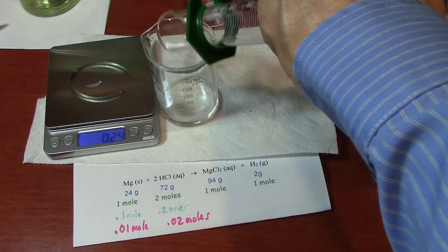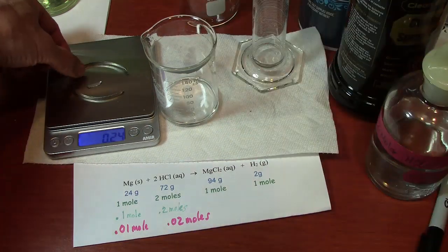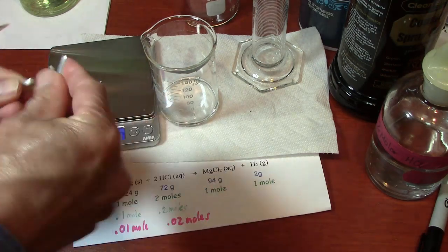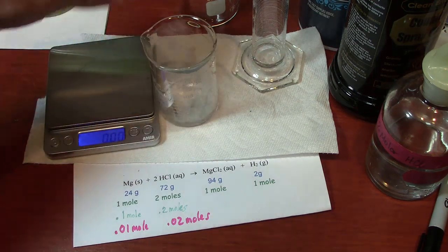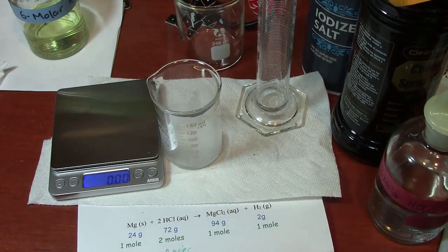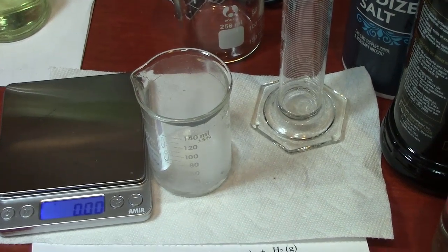0.02 moles of HCl in the beaker, and in goes the magnesium. I'll tear it up a little bit so it fits better. In goes the magnesium, and you can see a lot of fizzing, some steam arising from the beaker. That's the exciting reaction we know and love.